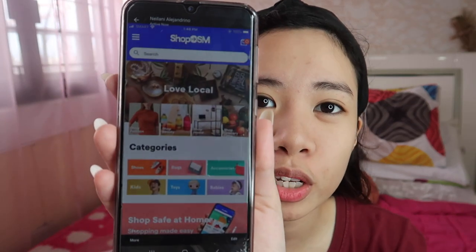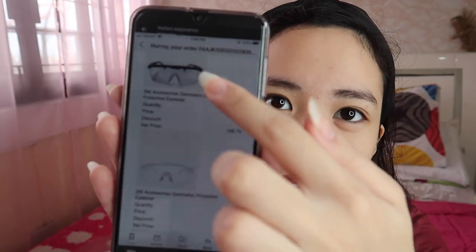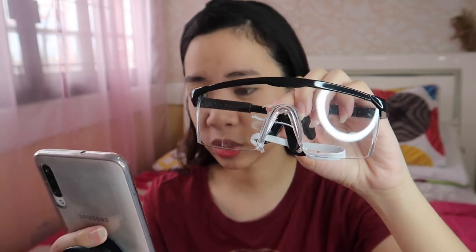So, the first products I'll show you are from Shop SM. On the Shop SM app, the products we bought include two types of goggles. The first one is the SM Accessories Geometric Blacktop Frame Protection Eyewear — or just goggles in short — priced at 149.75 pesos, basically 150. Ito siya, guys — napakaganda niya.